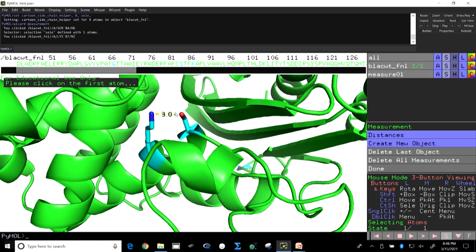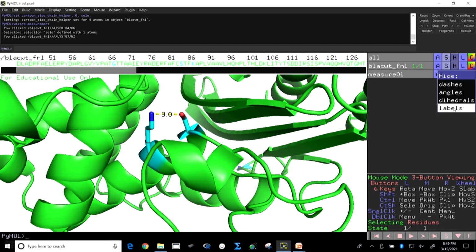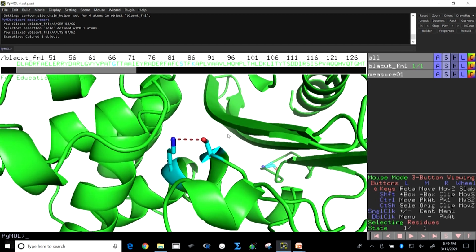So, when you do that, you could see that in this case the distance is 3 angstrom, which clearly shows that these two amino acids are in non-covalent interaction, which is hydrogen bonds. And if you remember, I am repeating again, you will not take the name or the colors which are given here, you go back and do it in the PowerPoint. You could make it ruby colored, generally default, but do not put the distance.